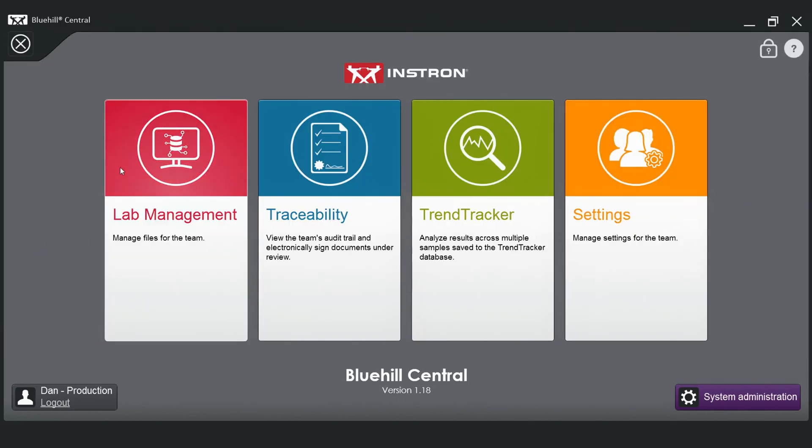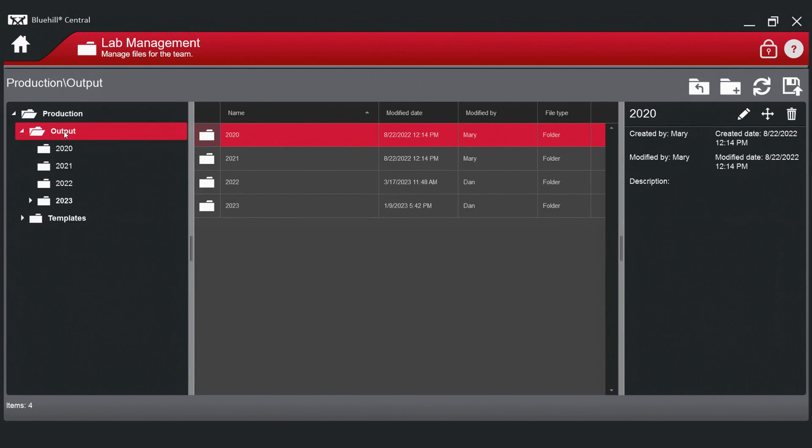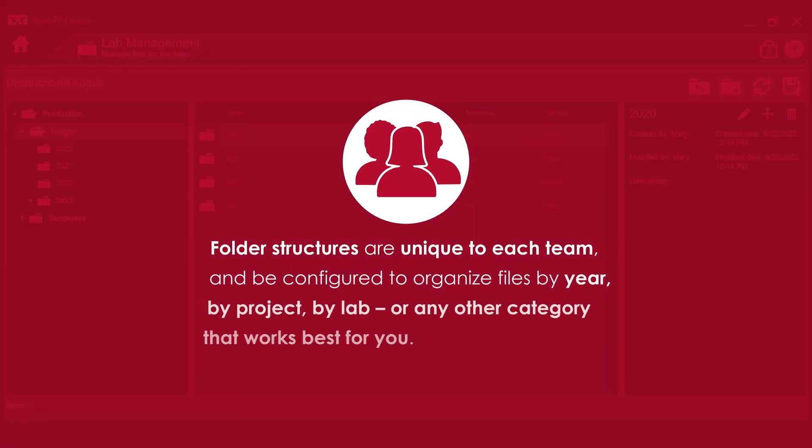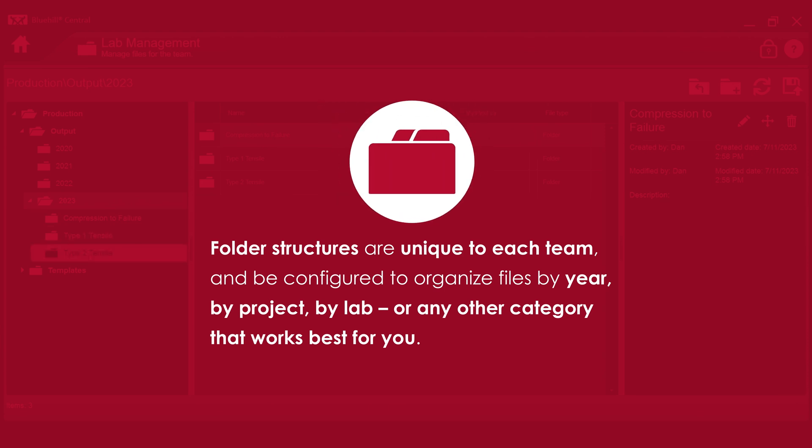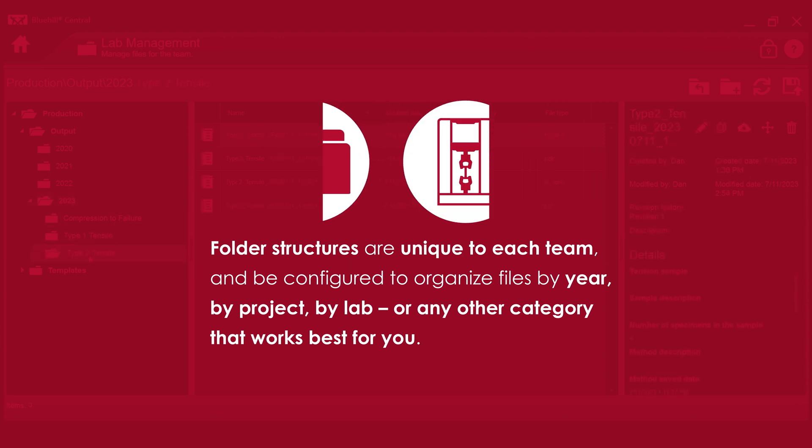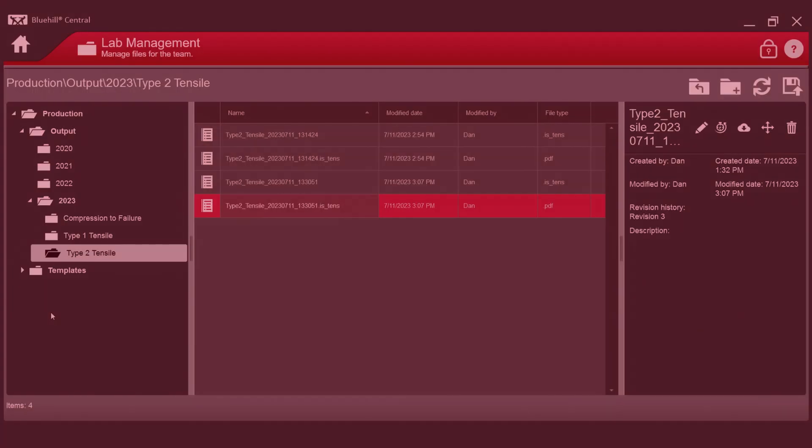In lab management, you choose the folder structure that best fits your needs. Folder structures are unique to each team, and they can be configured to organize files by year, by project, by lab, or any other category that works best for you.